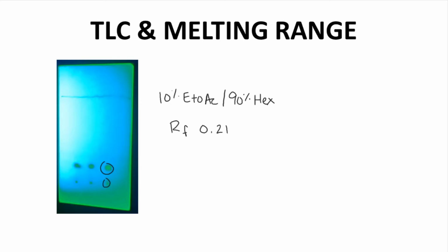Pristine is a word of praise that organic chemists use to describe a very pure product. This reaction product is perhaps not pristine. The melting range of the isolated product was 105 to 108 degrees Celsius. The literature value, which I took from the reference shown in the reaction slide earlier in this video, is 110 to 111. So our experimental melting range is a bit low and a bit broad. Both the TLC and melting point are consistent in that the product is probably not of very high purity. Let's see what the NMR indicates.